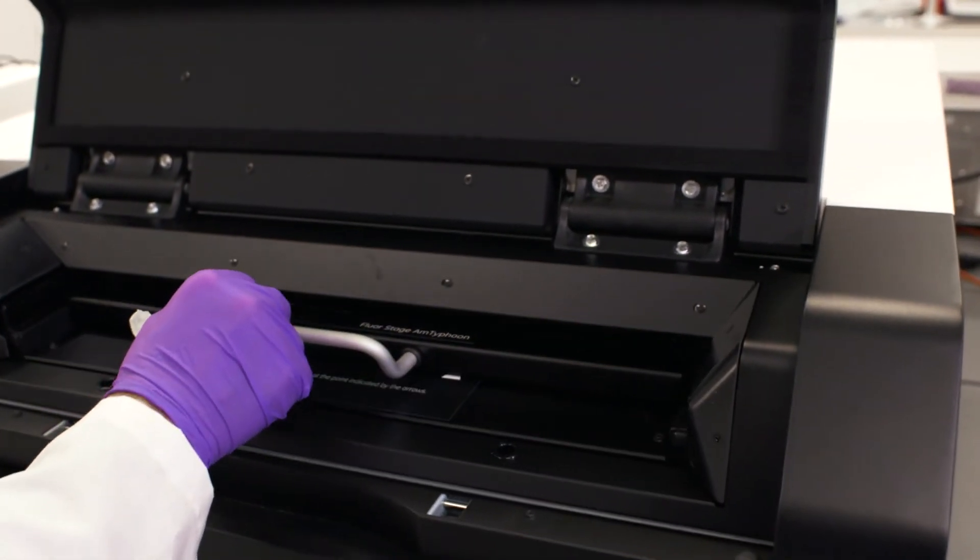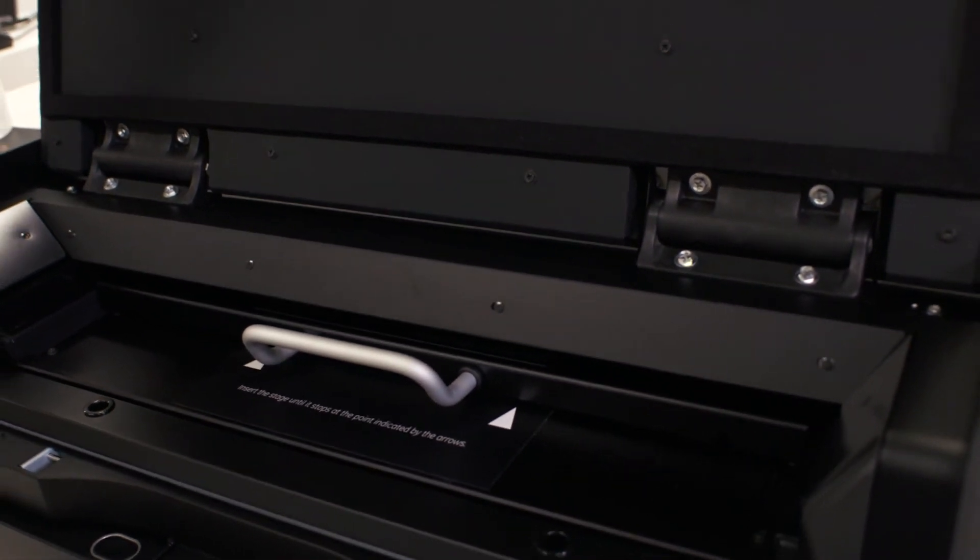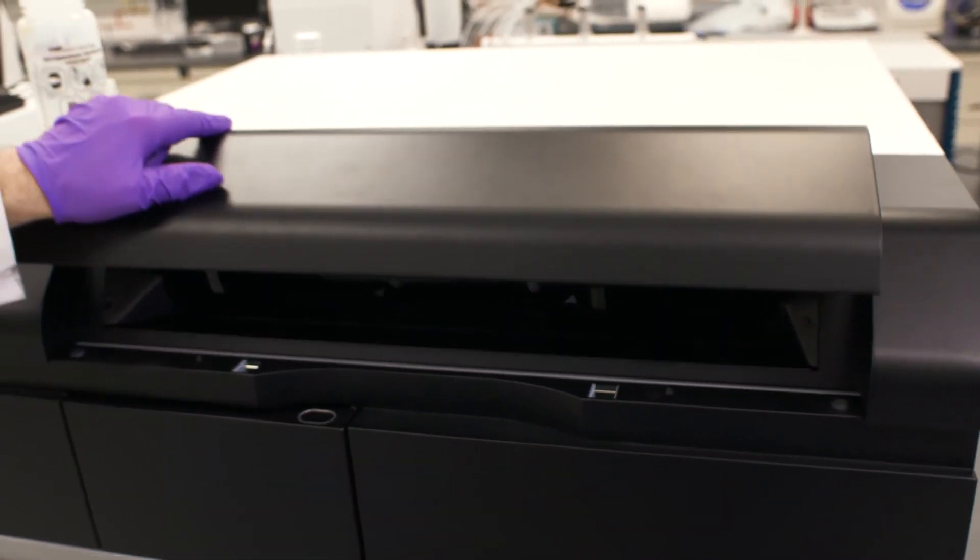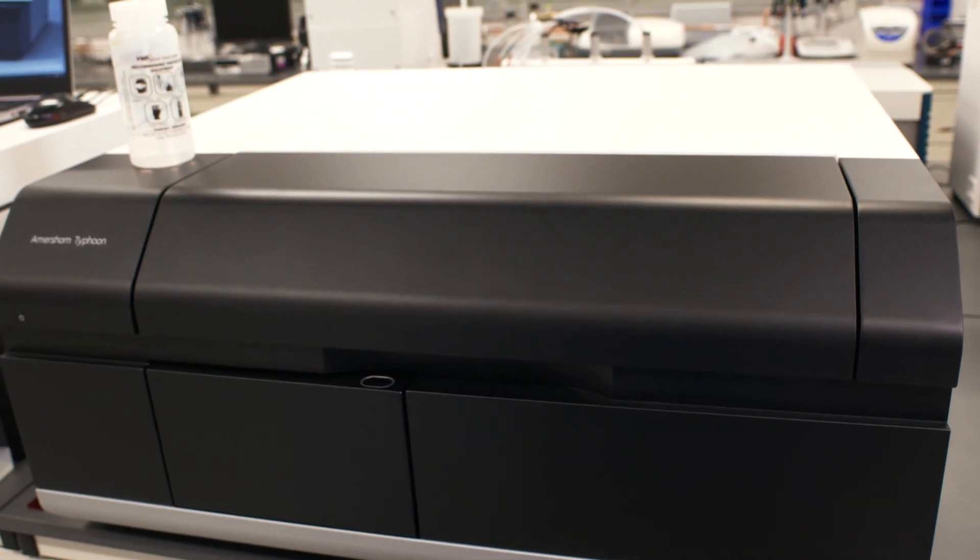We're going to close the instrument. Take note of the orientation of where we placed the gel with the letters and numbers. Then we close the lid. Now we can set up in the control software to capture our image.